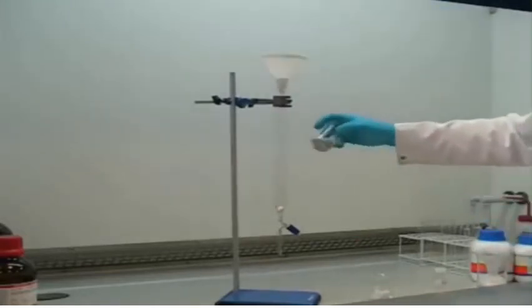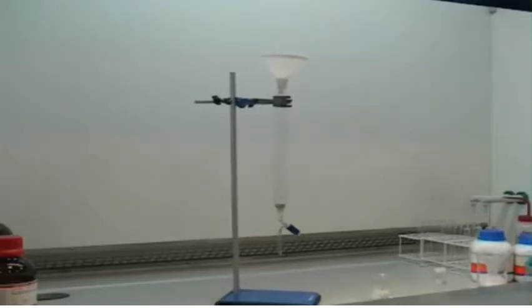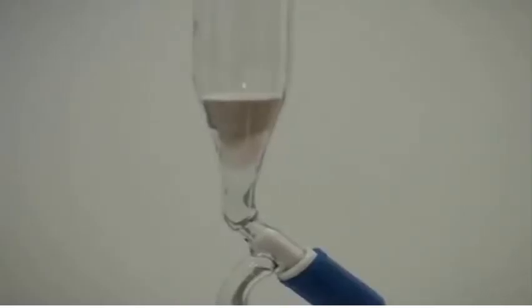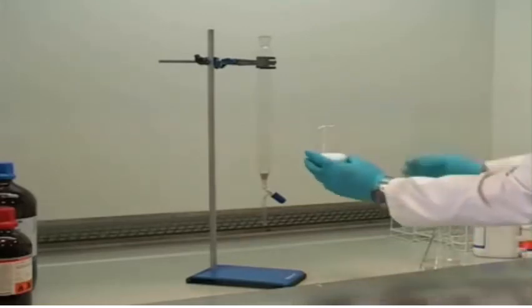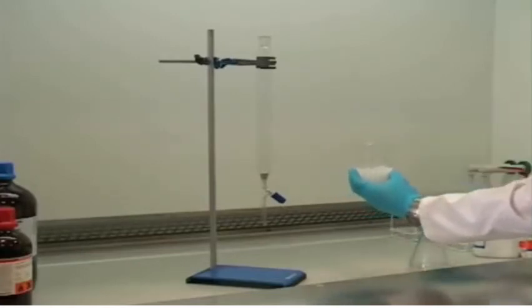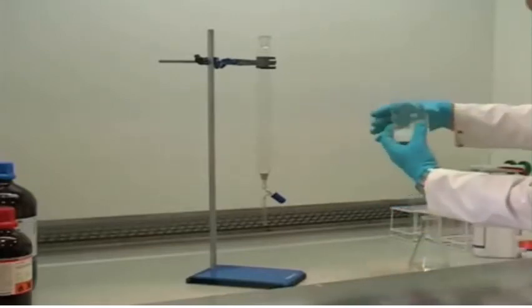Next, a small amount of sand is poured in to a depth of about 1 centimetre. Here you can see the sand forming a level surface on top of the cotton wool. We then take the appropriate amount of silica in a beaker, and this is then made into a slurry using the solvent we're going to run the column with. This solvent is known as the eluent. Here you can see us swirling the silica with the solvent before pouring it into the column very carefully.